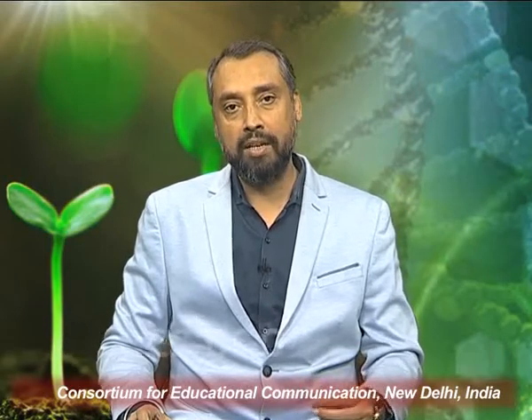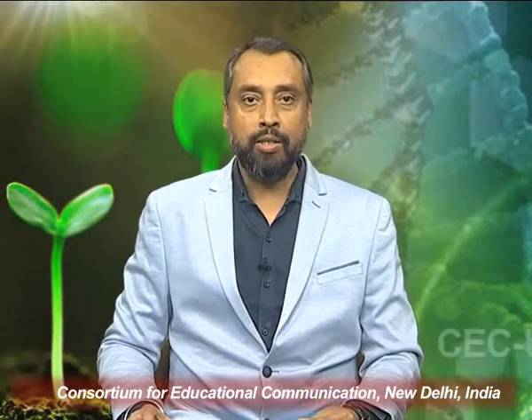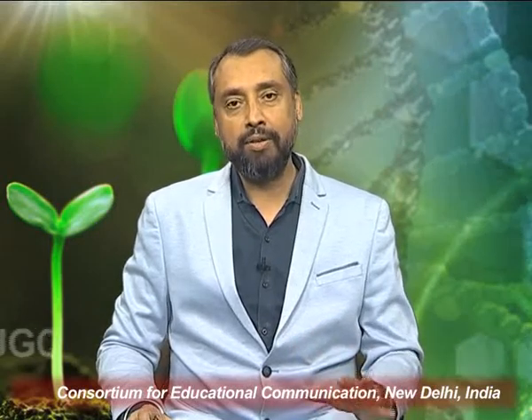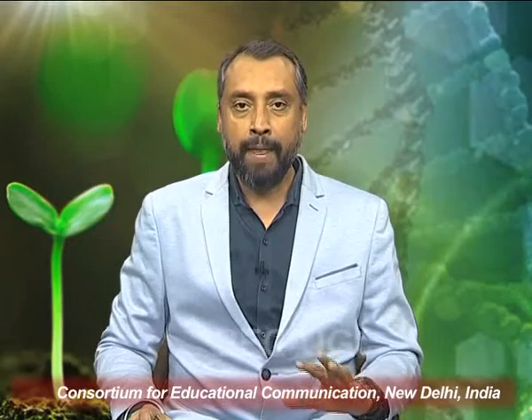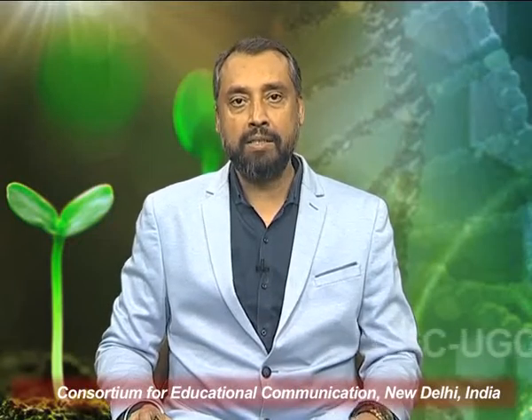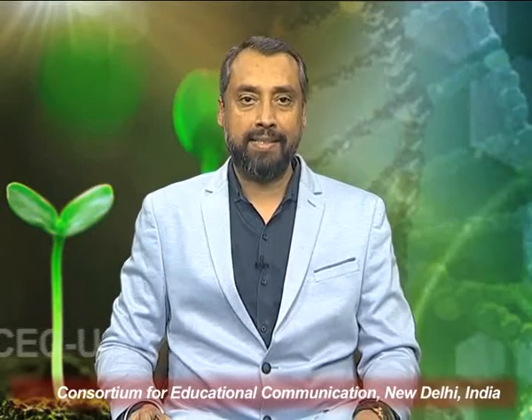This knowledge of basic instruments is a must for any basic science student. So we shall start with the first and foremost equipment which any lab will have, and that is laboratory balances, also called weighing balances.